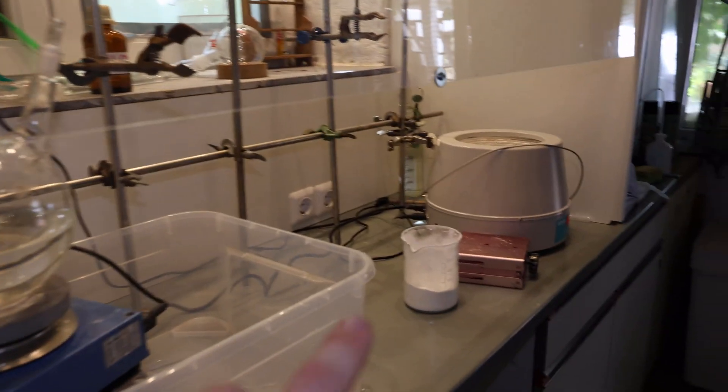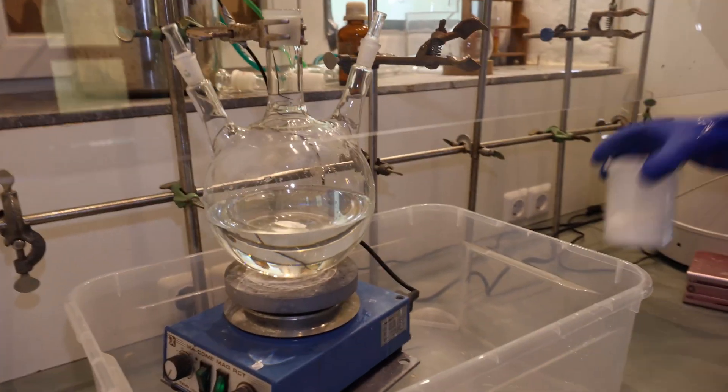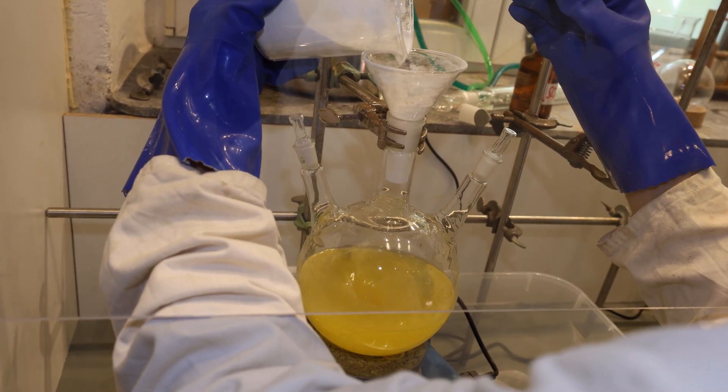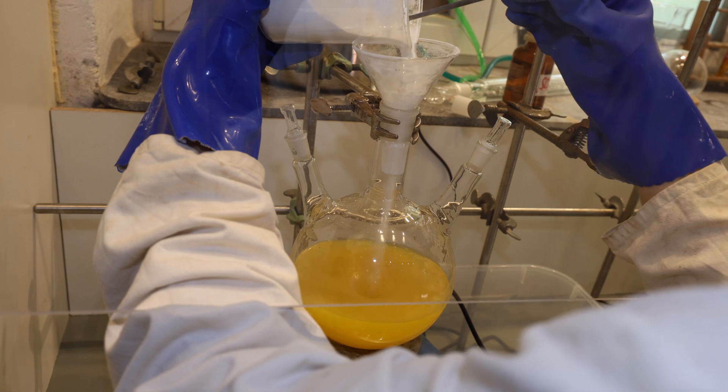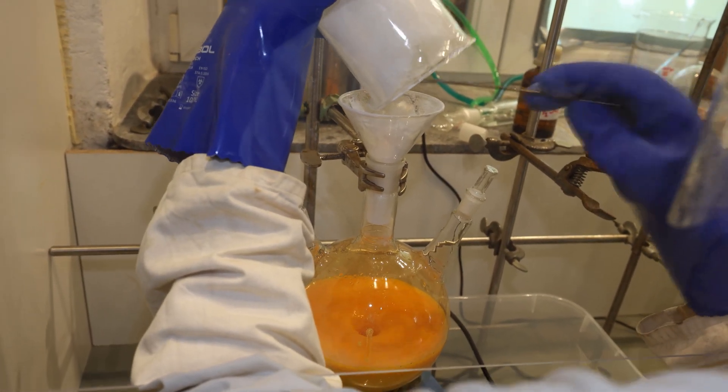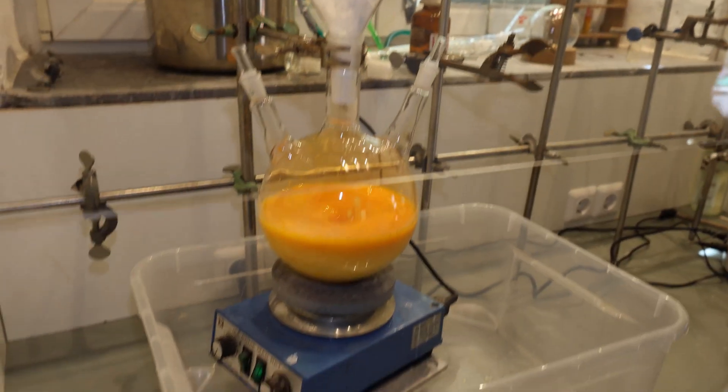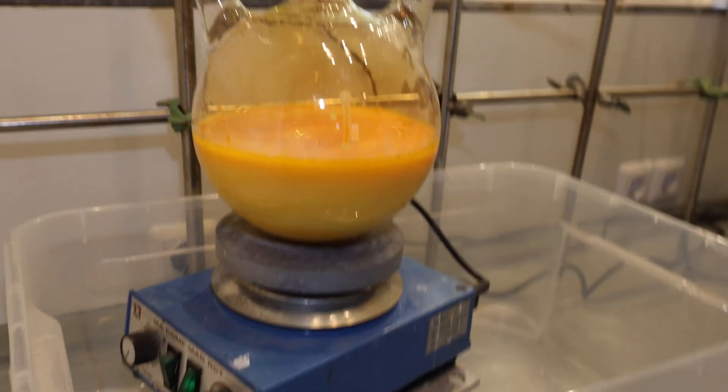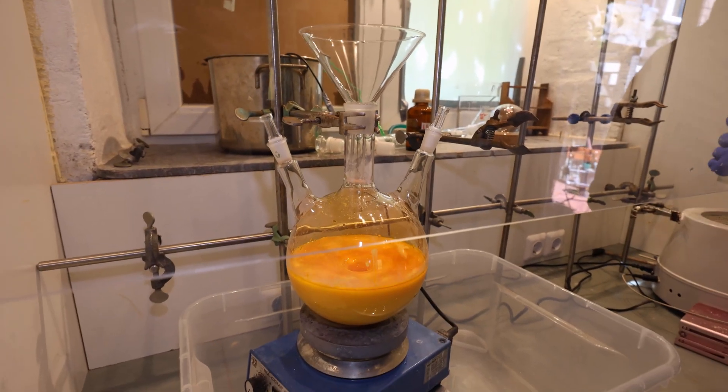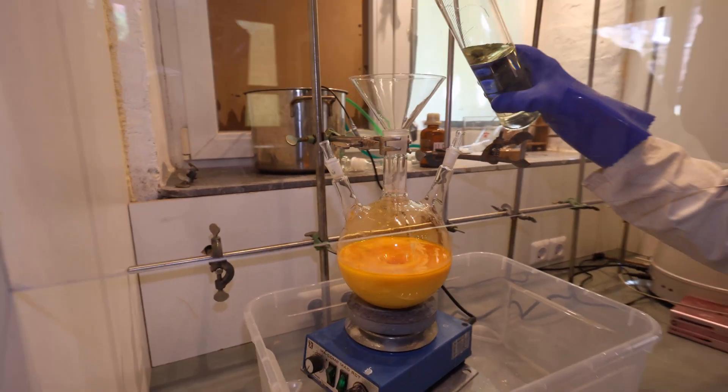Next we're going to need to put the TCCA in there somehow. All right now we're going to add the hydrochloric acid and this will increase the bromine production quite a bit.